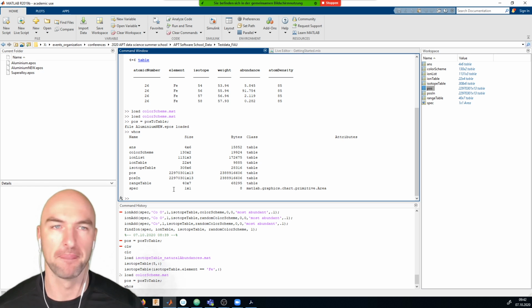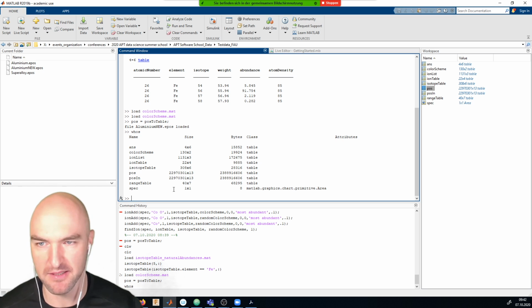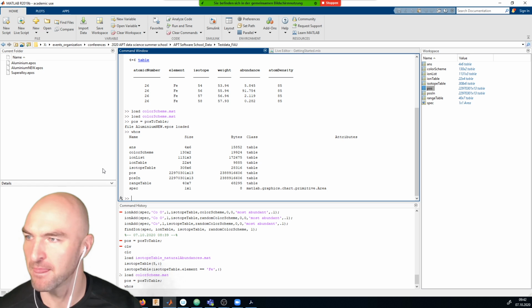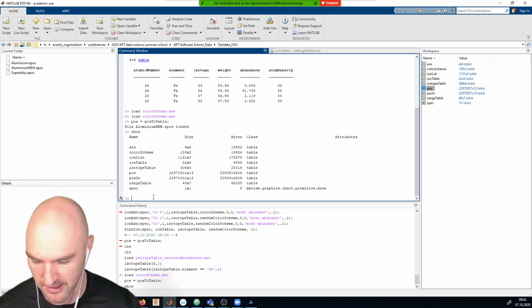Anyway, so one very simple thing I can do already in this case is, for example, crop only the first maybe 1 million atoms. I can do that very easily.